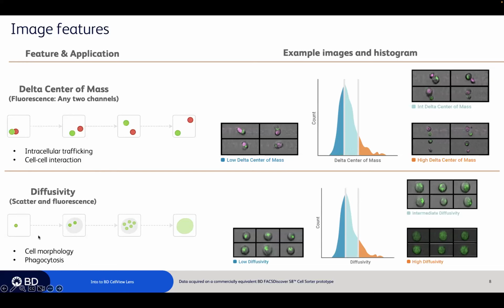Diffusivity is essentially a measure of, is the signal more punctate or more consistent? Do you see those individual dots or not? And so again, another way that we could look at it in this histogram, some low diffusivity, medium. So here's the punctate showing up again to high, just sort of an overall expression of the parameter listed there.